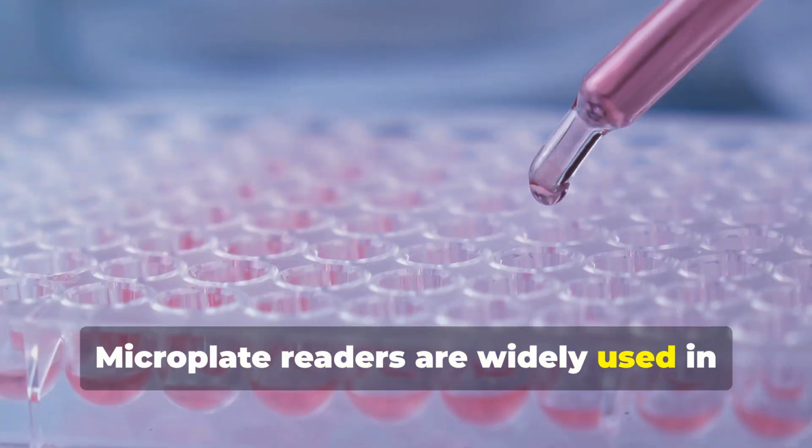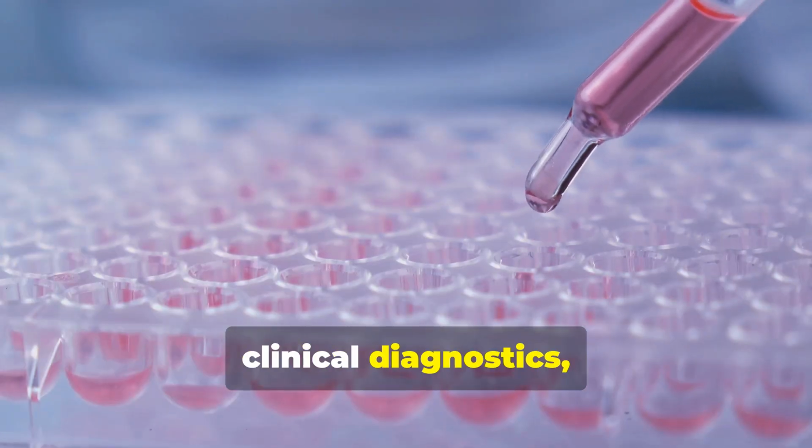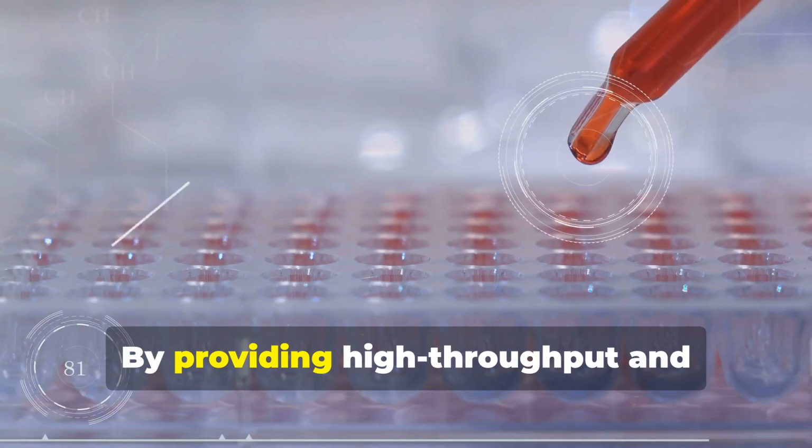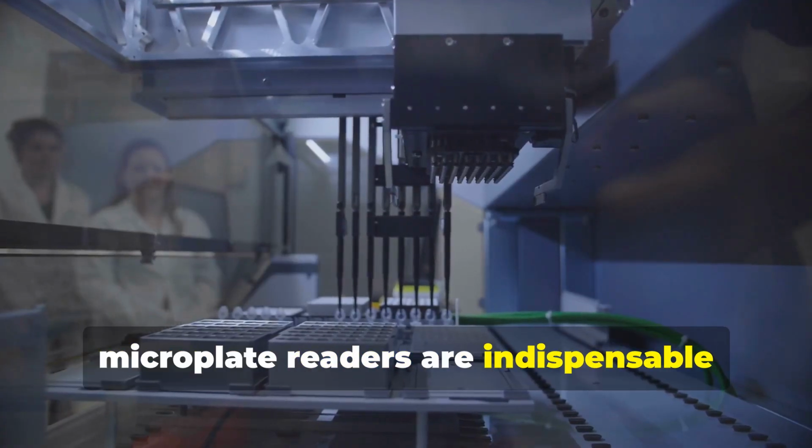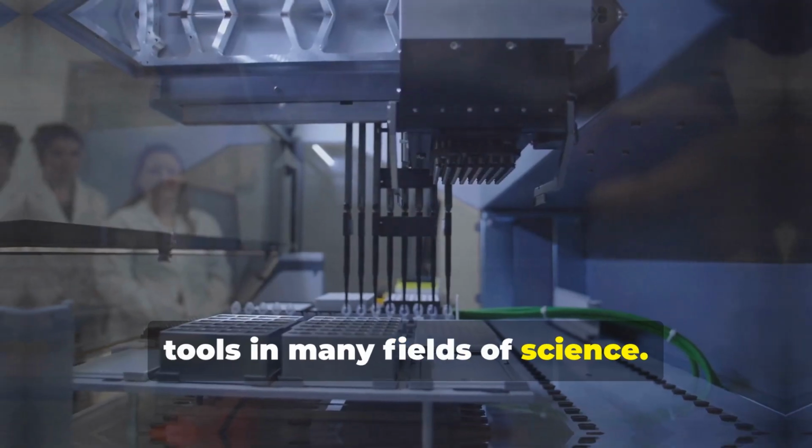Microplate readers are widely used in drug discovery, clinical diagnostics, and basic research. By providing high throughput and sensitive detection, microplate readers are indispensable tools in many fields of science.